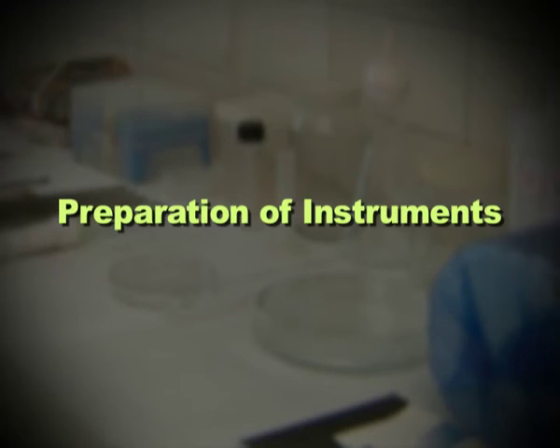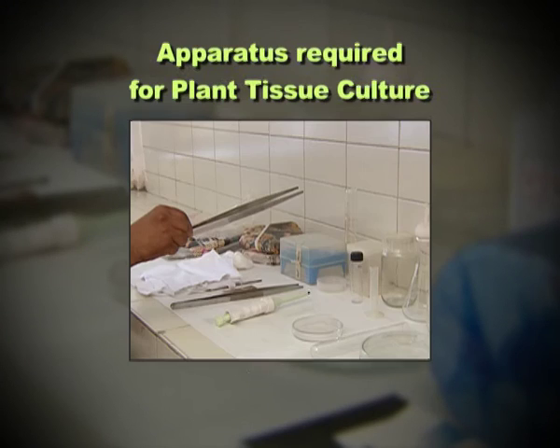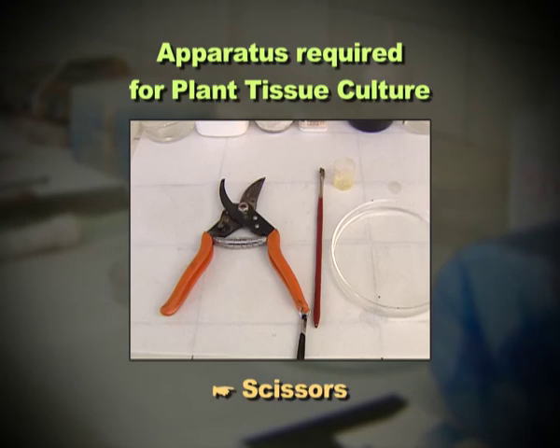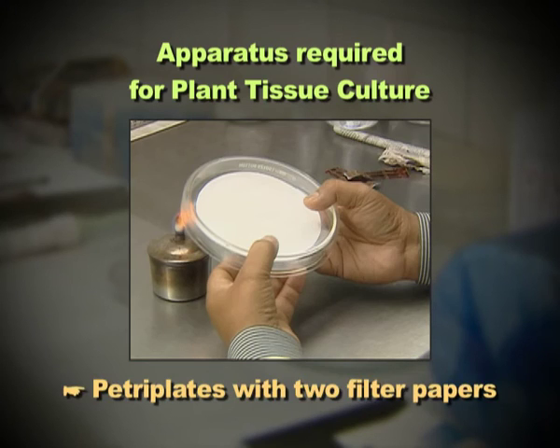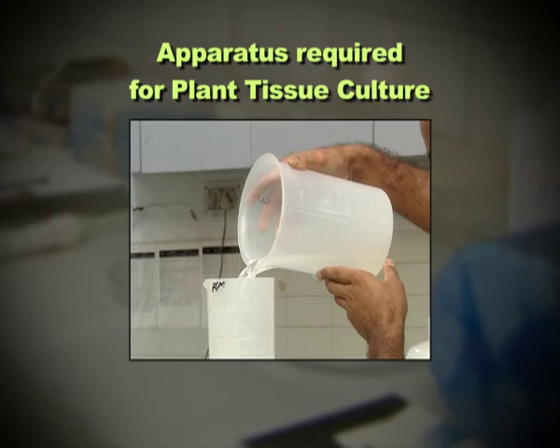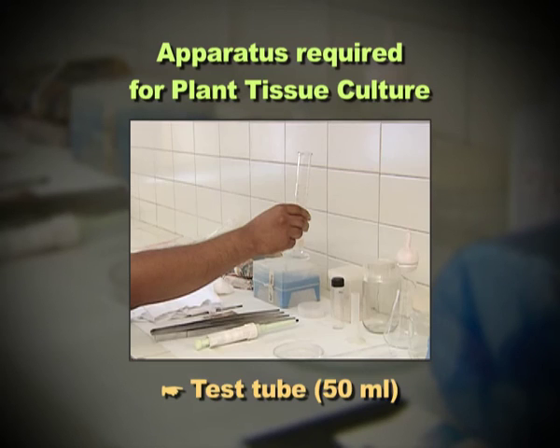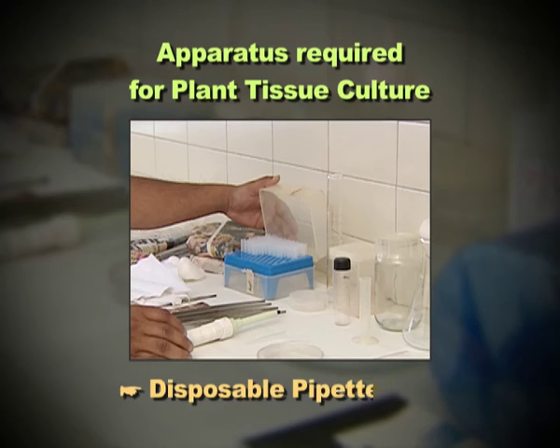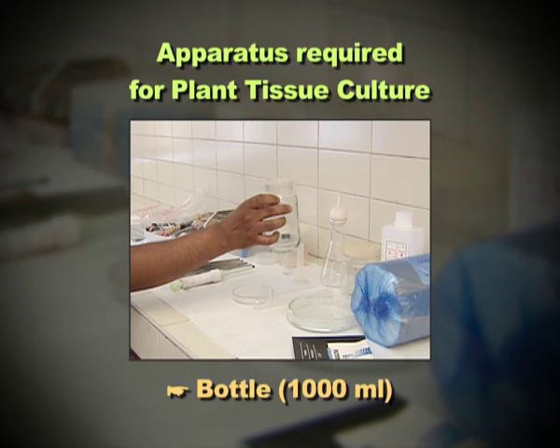Preparation of instruments. Apparatus required for plant tissue culture are forceps, scissors, blade holders, disposable but sterile surgical blades or sharp scalpel, Petri plates with 2 filter papers, a 500 ml beaker, 3 250 ml Erlenmeyer flasks, a 50 ml test tube, a box containing disposable pipette tips, pipettes, and a 1000 ml bottle with screw cap.